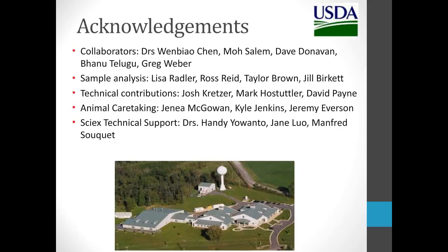Dr. Cleveland, our first question is, which housekeeping genes do you use in the gene expression study, and what selection criteria do you use for those housekeeping genes? The four housekeeping genes that we have included in each multiplex are beta-actin, GAPDH, an elongation factor, and also PPIA. Now, we don't always use those genes to normalize.